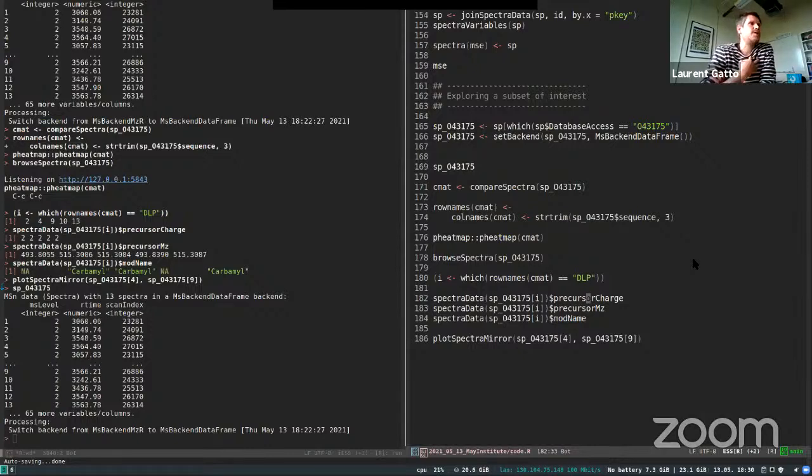So here I focused on raw data, but you could proceed with that analysis, with that concept of an experiment, and also add quantitative data that you would use for your statistical analysis, for example, using MS-Stats TMT if you have TMT data. So really that very much depends on where you want to invest your time to make sure that you understand and are in a position to reproduce all the steps of your analysis.